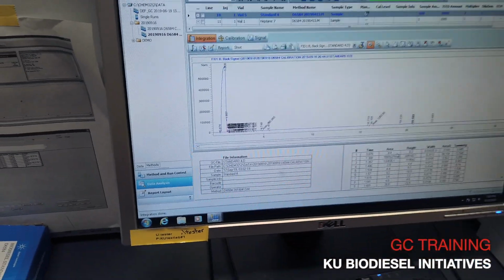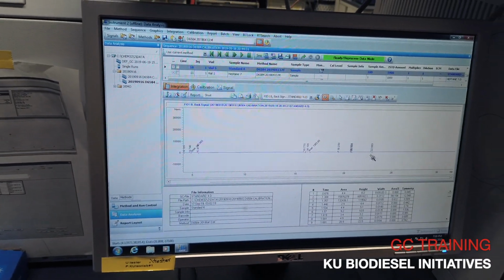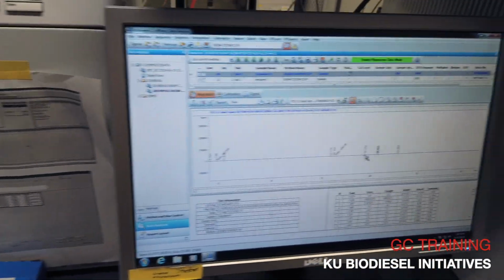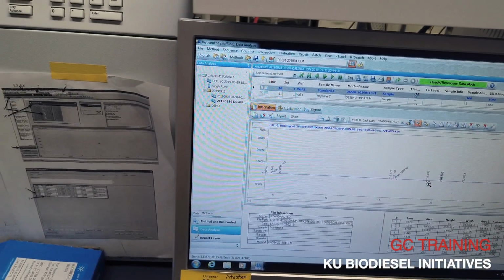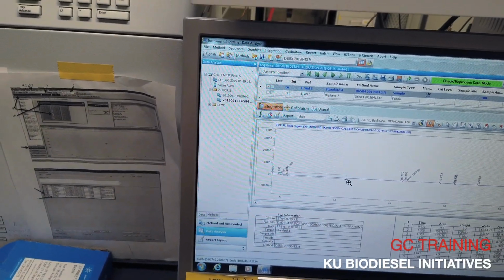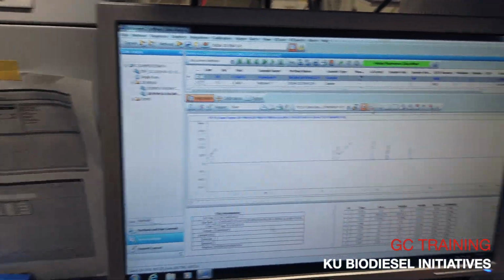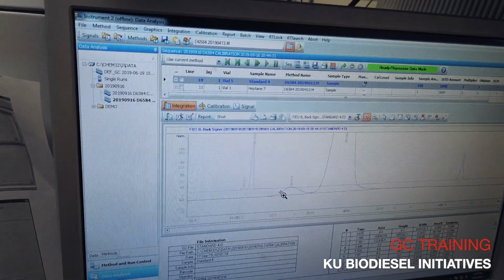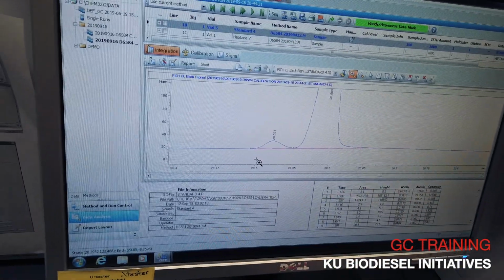Okay. Are these the smallest peaks right now? These are the second largest, so I went from biggest to smallest. I like to have that one be the representative one, because if you use the smallest one, then it might not cover all of the peak area of the biggest. So yeah, I went from standard 5 down to standard 1. Okay, now we're going to do this one. So 20.48.